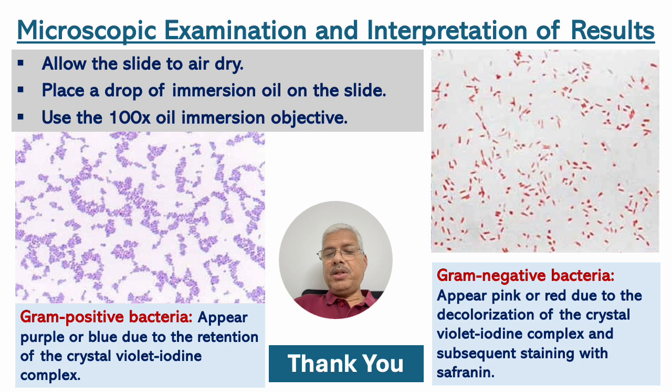The appearance of pink or red due to the decolorization of the crystal violet iodine complex and subsequent staining with the safranin indicates the presence of gram-negative bacteria.